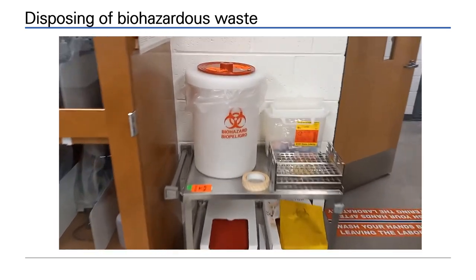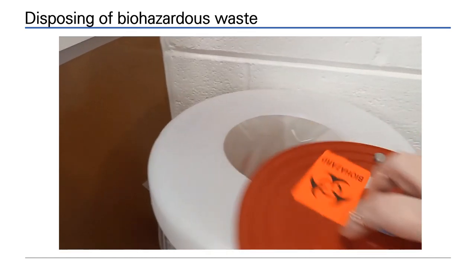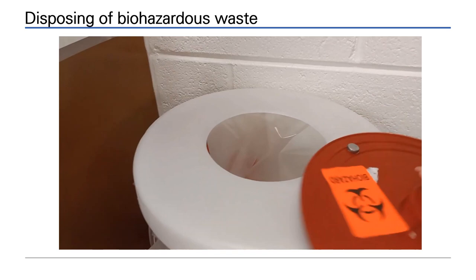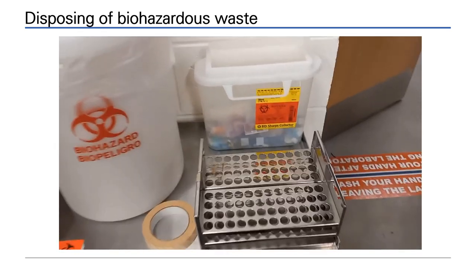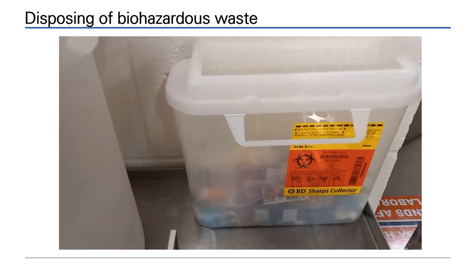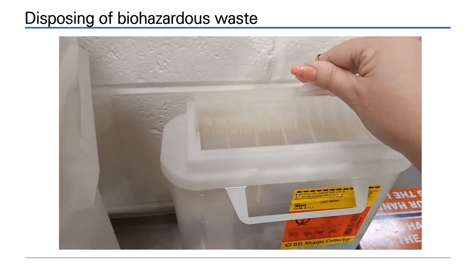Biohazard collection points are found around the lab. Biohazard bins have waste dropped into them, such as culture plates. Culture tubes are collected in racks. Any sharps, such as glass microscope slides, go into the sharps bin.